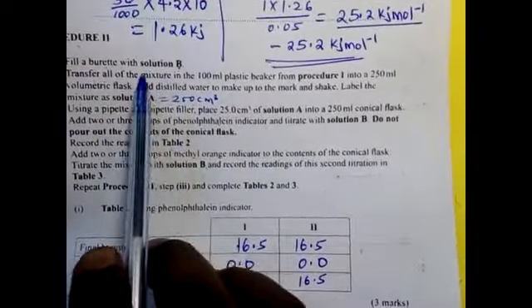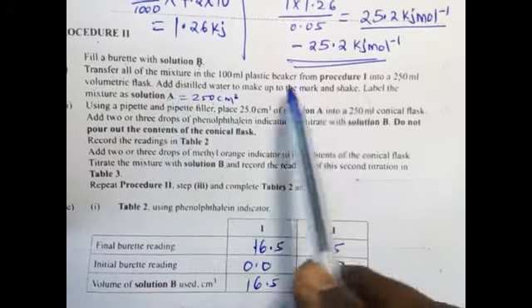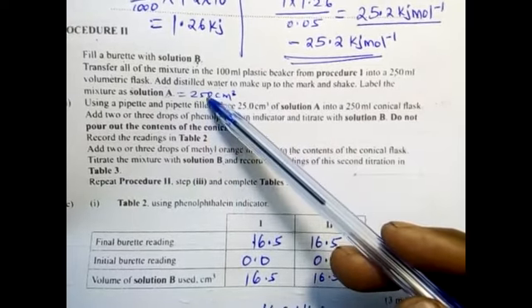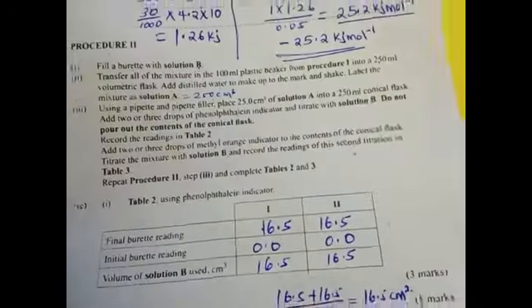We dissolved solid A in 30 centimeters cube from procedure 1. That solution, we put it into a volumetric flask. Then we add water to 250. So the mass in 250 is 5.3 grams. The one we used, right?